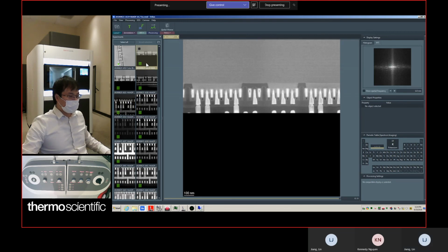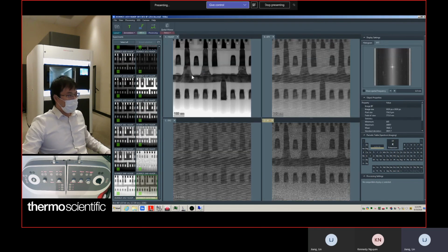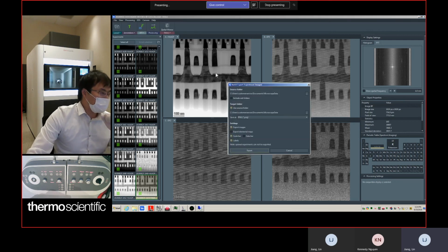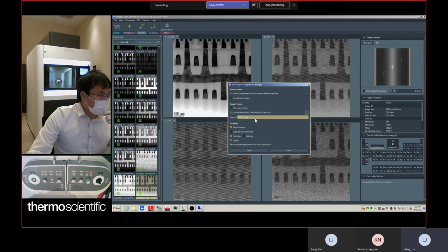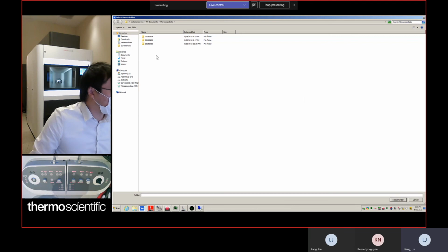Let's do some export. That's a batch export. You can select the location you want to do batch export. I use folder link, name, this one, and then set the folder. This is the target folder. You can also define the source folder, which is the same folder.